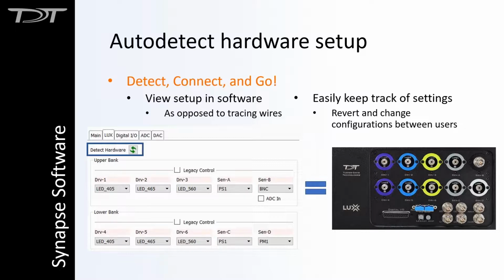And this will also help for keeping track of your settings. So if you have multiple users using the same system who are going to need to configure things differently, you can easily see what all is connected and revert back to previous settings so that you can complete your experiments.